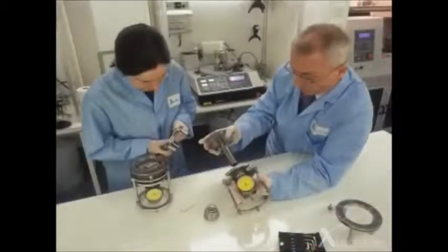An important part of most Logitech machine systems is the concept of technology transfer. Many years of experience in materials processing and equipment supply have clearly indicated that instruction manuals are seldom enough to ensure that the customer achieves the required results. It is for this reason that Logitech provides comprehensive operator training with each machine system, in the form of a full 3-day training course at our headquarters in Scotland.